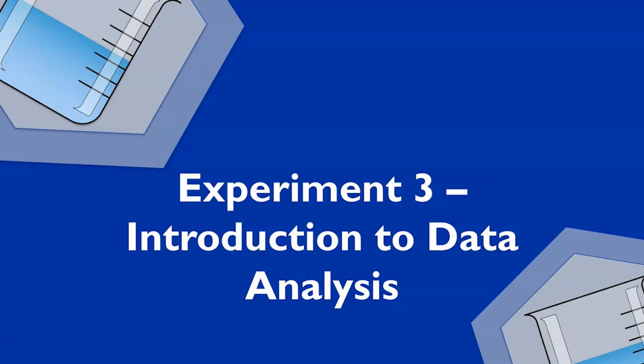In this experiment, we're going to apply skills we learned in experiment number 2 to determine the density of aluminum foil.